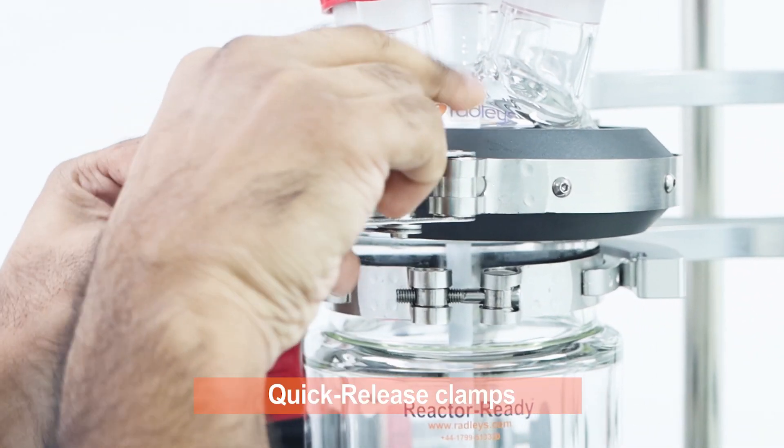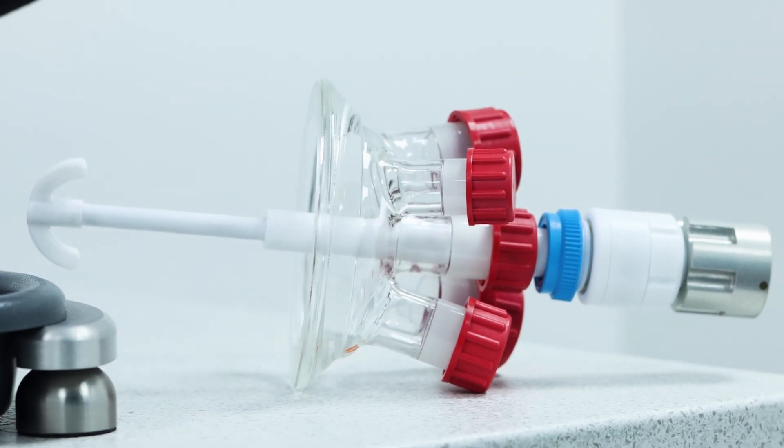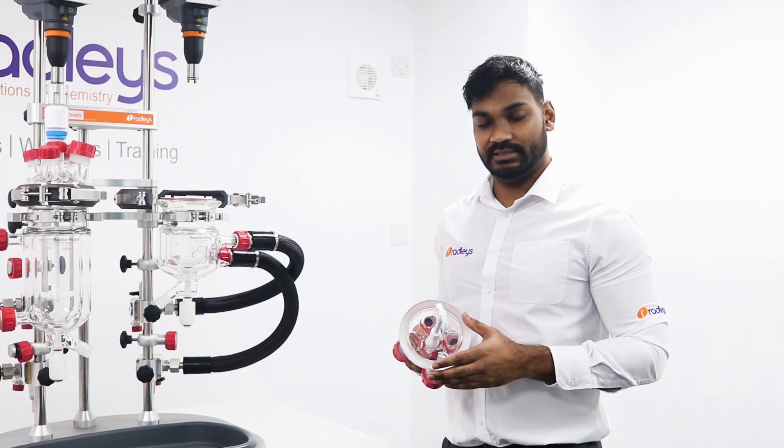Two separate quick release clamps secure both of the vessels independently, allowing for easy release of the vessels from the framework. Both the vessel and the lid have a flat flange with an FEP encapsulated silicon o-ring in between them for efficient sealing of the vessel contents.